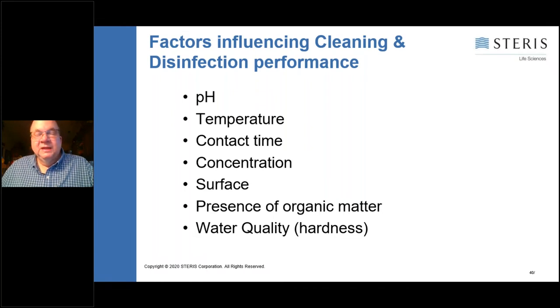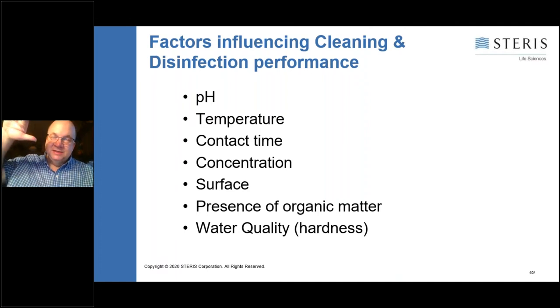So for example, temperature. If you're working in a cold room at -5 to 5°C, that will really slow down the reaction speed into the cell of the disinfectant or sporicide, and you may need, in fact, to have a longer contact time, maybe even 4 times as long as you would at room temperature. The same interesting phenomenon occurs if you use hot water. If you use water that's say 80°C, it can temporarily boost the efficacy of the biocidal product, but then you start to see a rapid decrease because you off-gas the active, like the phenol or the H2O2.